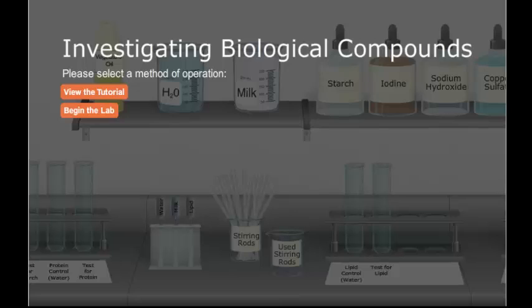Another organic compound we're going to look for in our solutions are lipids. Lipids are also called fats. This is present in vegetable oils. It is present naturally occurring in other plants, such as the avocado. Lipids can also be found in animal products. Think about a steak. So that white, fine grain that makes it so delicious, that is a fat. That is lipids. So we're going to also test for lipids.